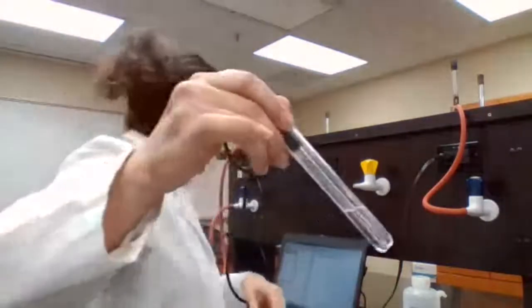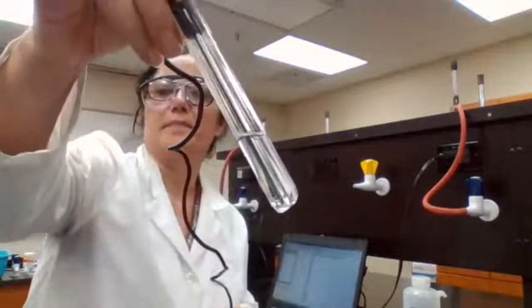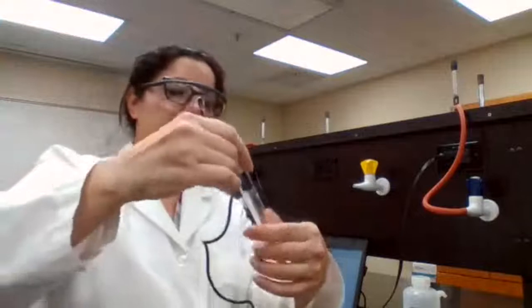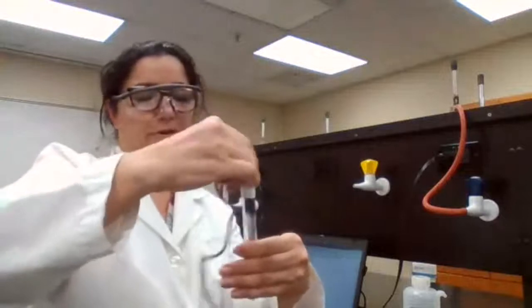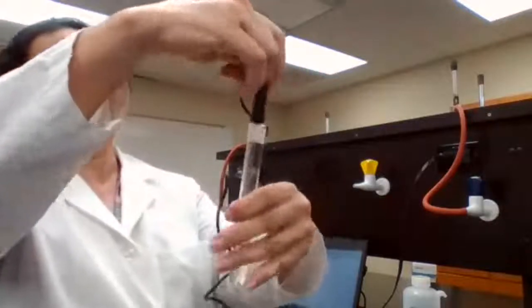You see, the temperature is 24 and no crystals yet. So I just asked for some ice. As soon as we get ice, we can place it in ice. Maybe at lower temperature, the crystal is going to form. I don't see any crystals yet.